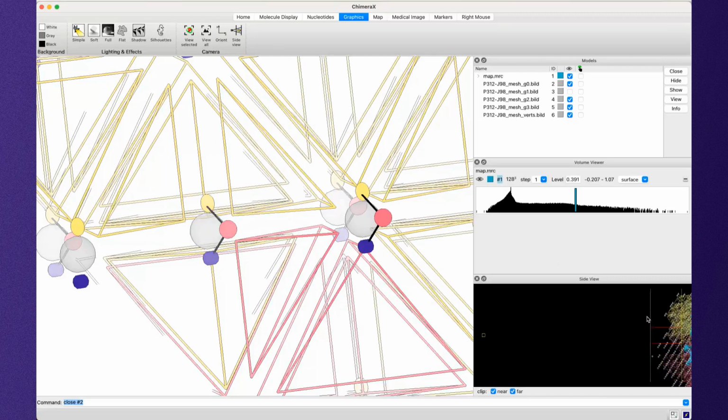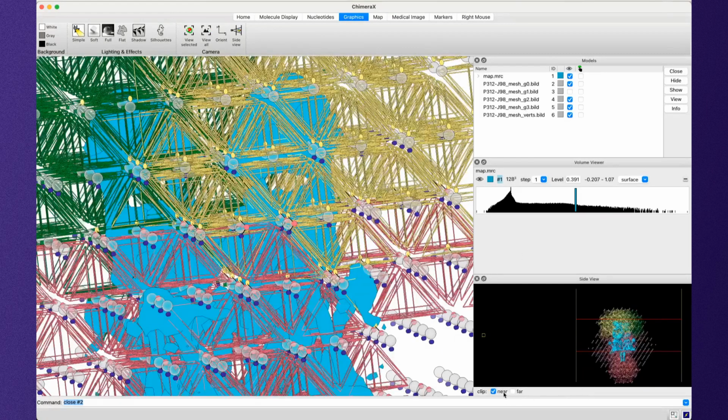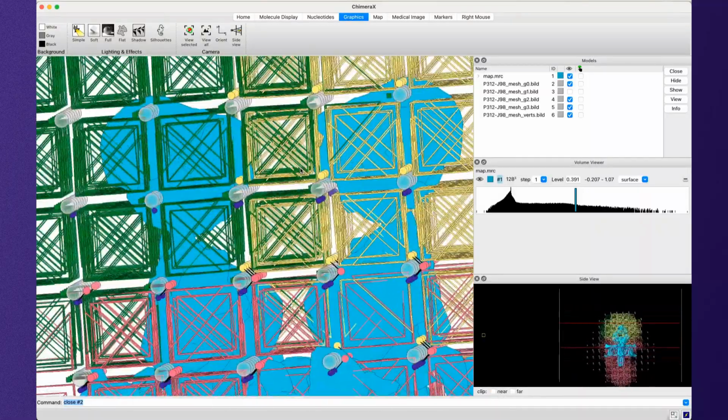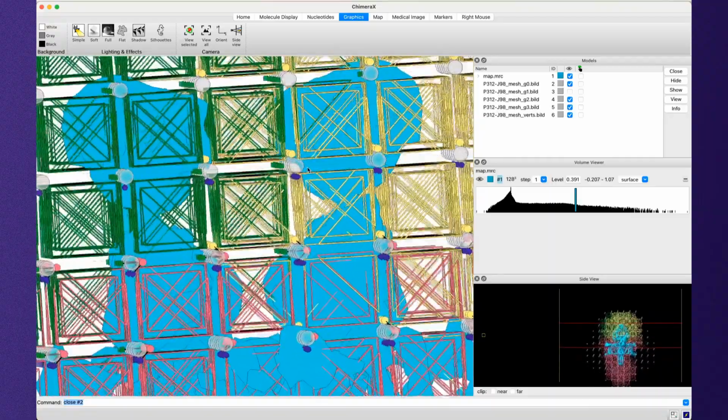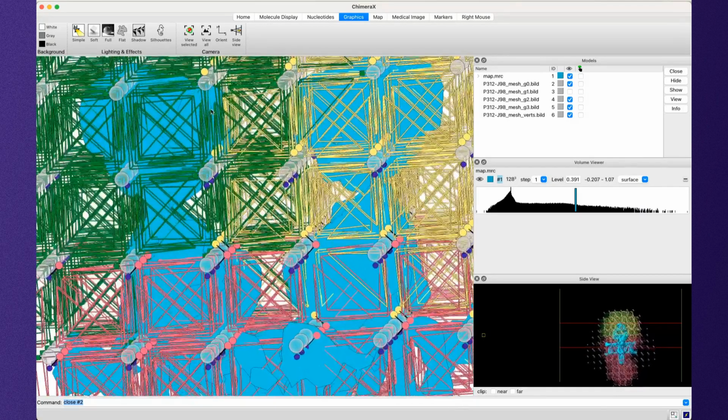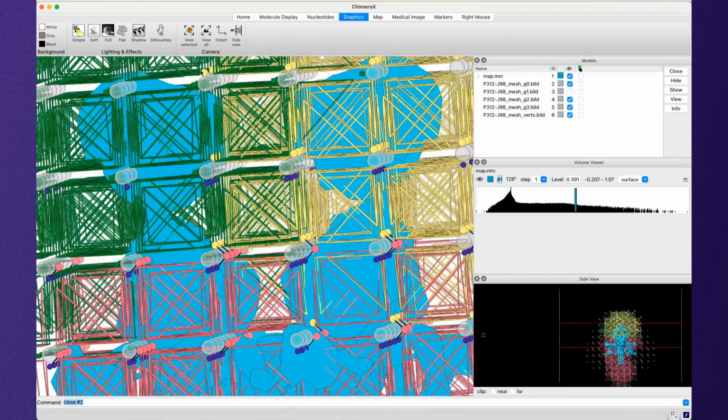Okay. So now let's zoom back out and compare that to the green mesh, which is our other fab here. And you can see from this view where we line up all the vertices along this way that the green and yellow meshes do have overlap. And that's because just like the fab and the micelle, we want these green and yellow meshes to be able to move independently. So when this part of the fab moves left and this part of this fab moves right, what can happen is the yellow mesh can take its copy of this vertex to the right to match the deformation we see here.